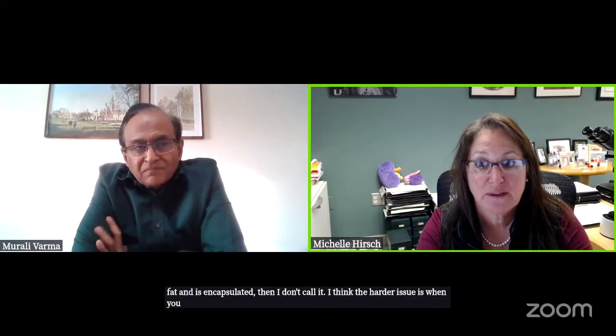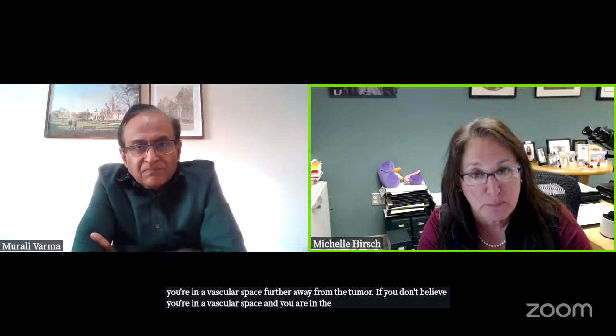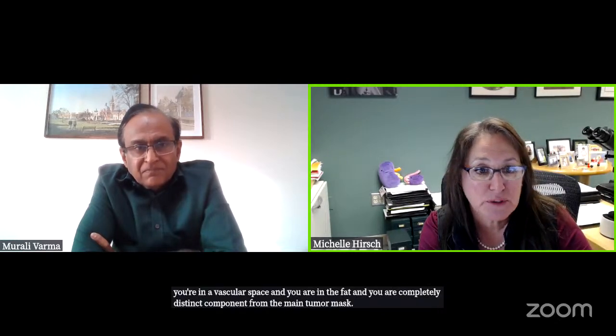I think the harder issue is when you have something distant or slightly away, maybe 1 centimeter, 2 centimeters away from the main mass, but it's completely encapsulated. And I think the thing Dr. Williamson talked about is, first and foremost, try to decide if you think you're in a vascular space further away from the tumor. If you don't believe you're in a vascular space and you are in the fat and you are a completely distinct component from the main tumor mass, then I will describe it and usually consider it PT3A.